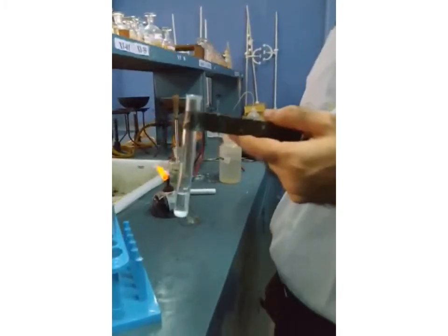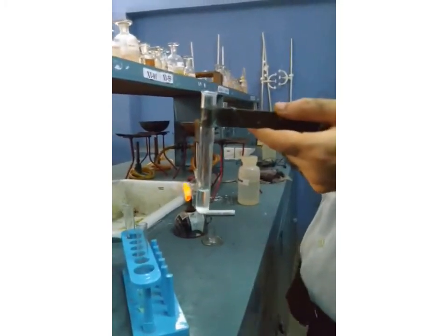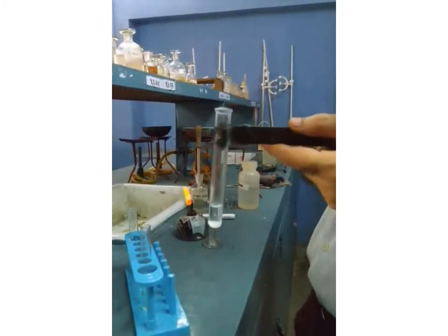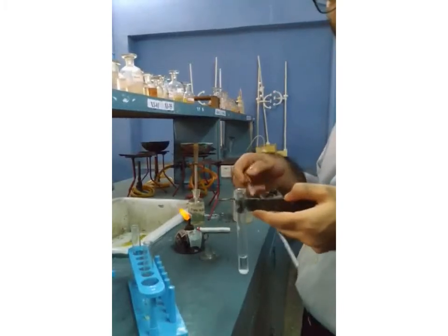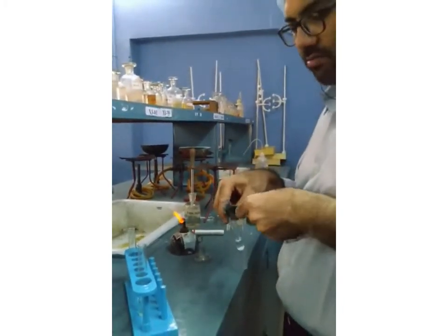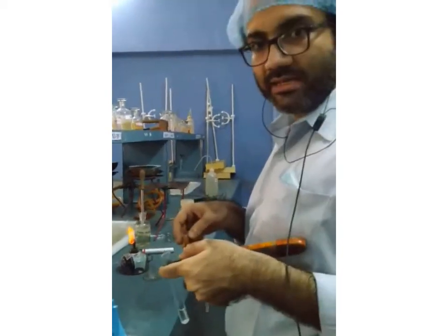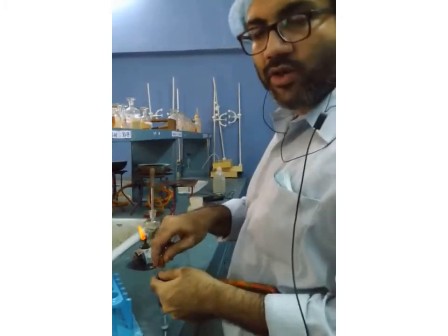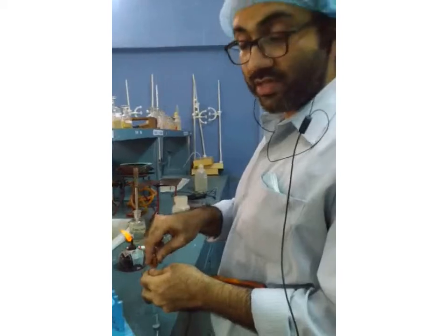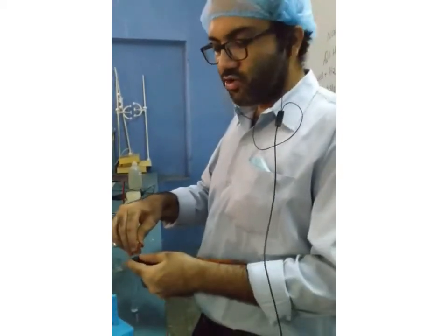If I start heating this, ammonia gas will come out, a pungent smelling gas. But since this is a video session, you will not be able to smell it. For that reason, I'm going to show you a confirmatory test of the ammonium ion. Any ammonium salt reacts with bases or alkalis to give ammonia gas. When ammonia gas reacts with Nessler's reagent, K2HgI4, it turns the solution brown.